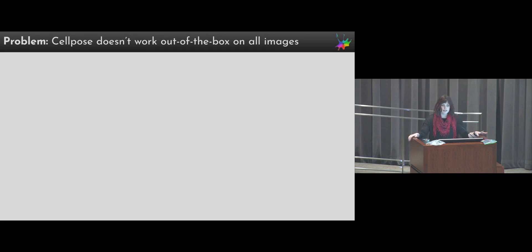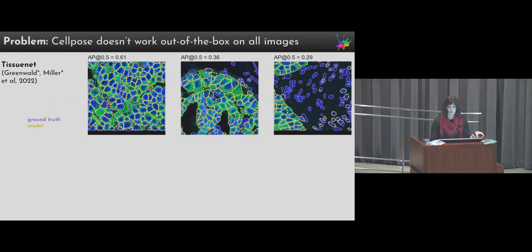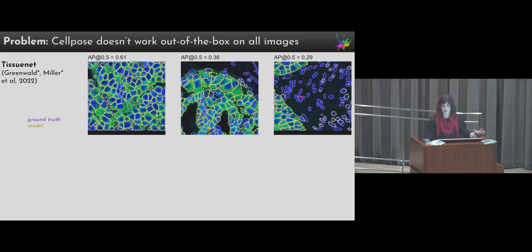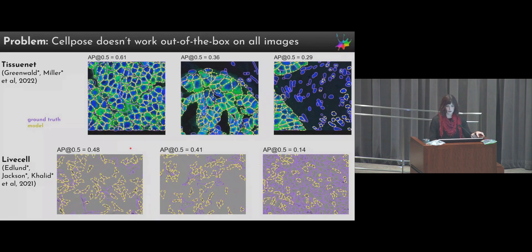We were fairly happy for the use cases we had, but it still didn't work out of the box on all images. For example, the TissueNet dataset came out which has a lot of images that look like this, and if we run CellPose on these images out of the box it looks okay — ground truth is in purple, the CellPose model in yellow. It looks decent on some images, but on others there are nuclei labeled in the ground truth that CellPose doesn't label. CellPose has never really been trained to segment nuclei without cytoplasm labels. We also tried another recent dataset from live cell imaging from several different cell lines, and running CellPose out of the box misses quite a few of these cells as well.